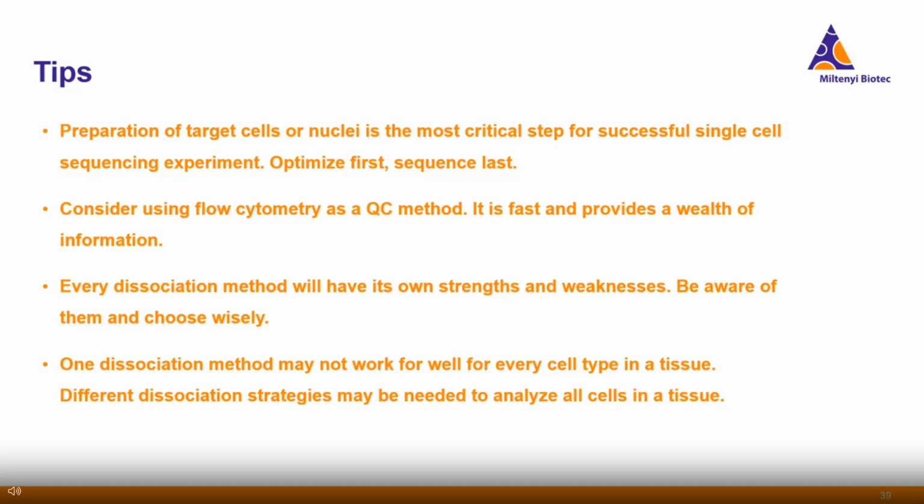Consider using flow cytometry as a QC method. It's fast and provides a wealth of information. I just always like putting this in here because I have a genomics background and I wasn't exposed to flow until I started at Miltenyi, and it really is fast and there's a lot of information there. So if you are more of a molecular person, not used to the cell side, but now you have to start dissociating tissue and working with cells to do single cell sequencing, if you have access to flow cytometry, I definitely recommend it.